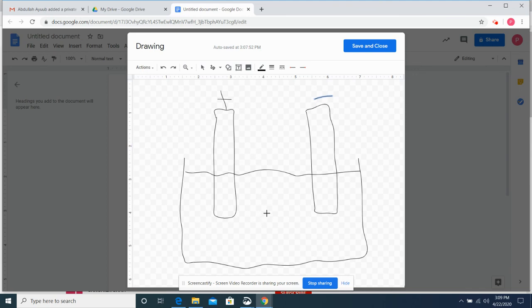One last thing, we are putting this into the liquid. All right, this is the formula for copper chloride that you're going to be using. Now, you guys have drawn particle drawings of things when they've dissolved before, okay? But in this drawing that you're making today, in your particle drawings, you're going to make particles that show what's happening in here.